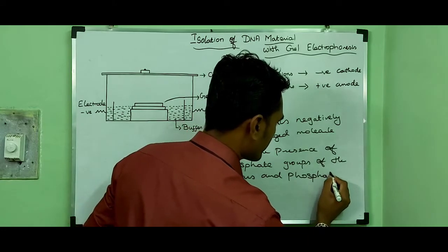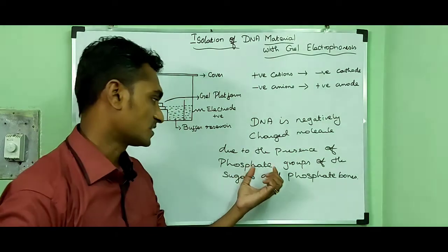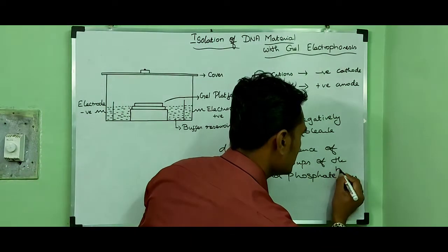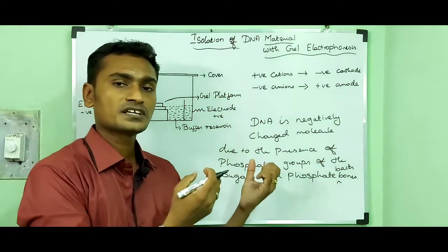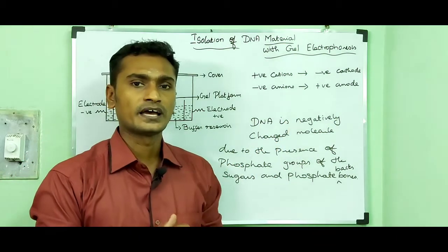So when it is subjected to an electric field, it moves towards the positive anode.